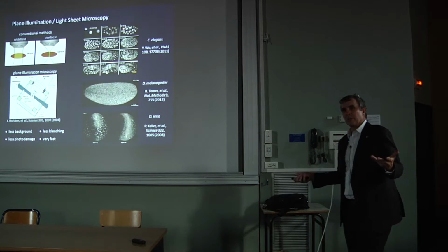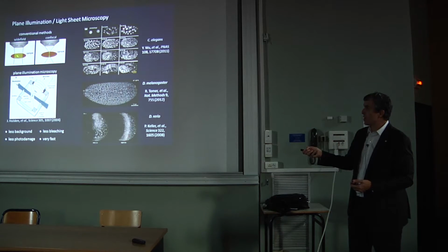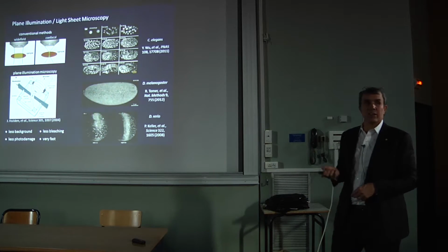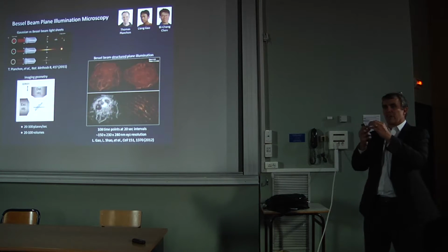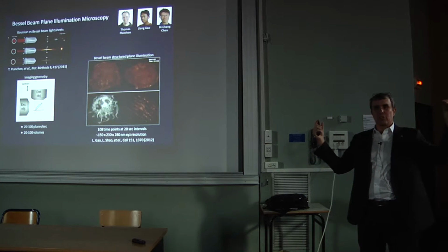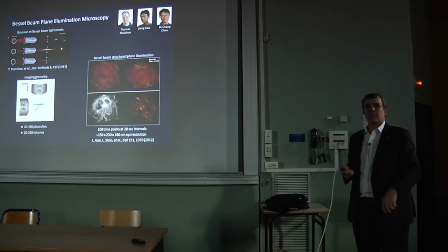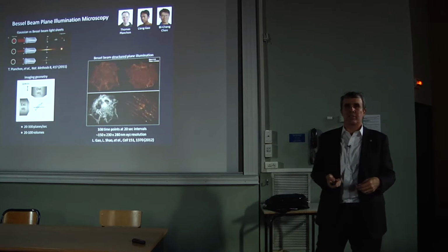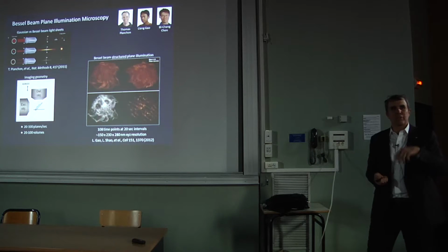And furthermore, you illuminate the whole plane at once, so it's easy to snap that with a fast camera, then sweep to the next plane, snap that, boom, boom, boom, boom, and get your 3D image. That's been transformative for studying embryogenesis at single cell resolution. But it has a limitation, which is that there's a trade-off just because of diffraction between the flatness of a light sheet that you can create, over how big of an area it can stay flat, and how thick the light sheet is. And over the dimension of a single cell, it means it needs to be about 3 to 5 microns thick. Well, a cultured cell is maybe 5 to 10 microns thick, so you're not gaining much benefit from the plane illumination in that case.